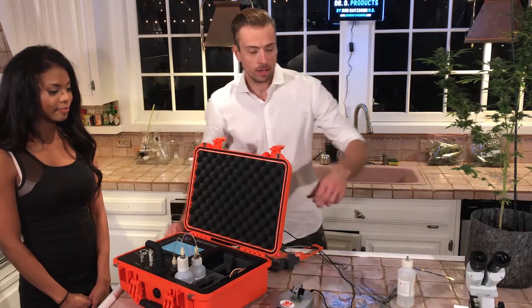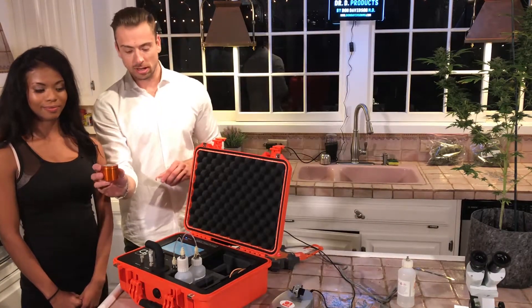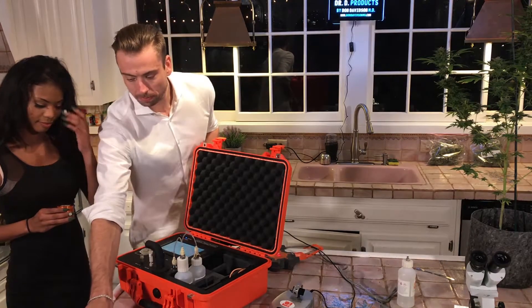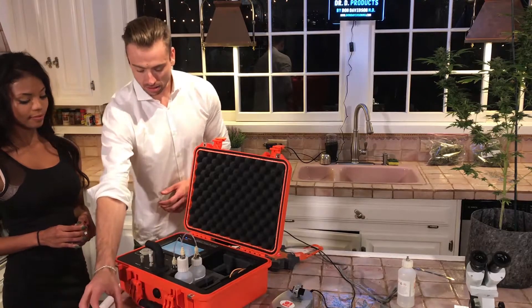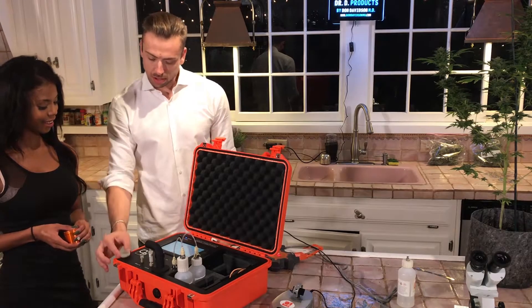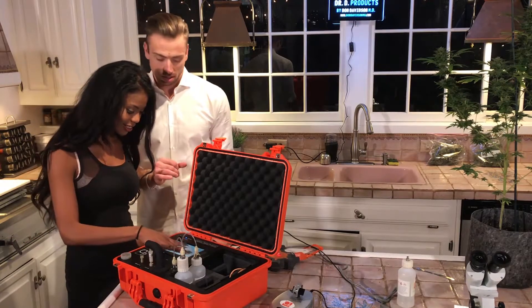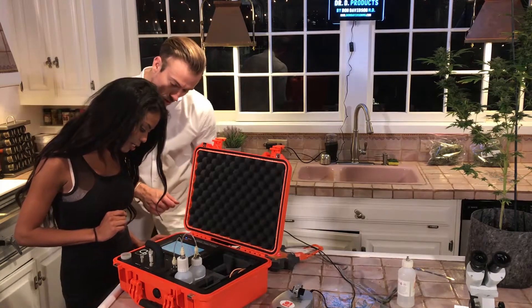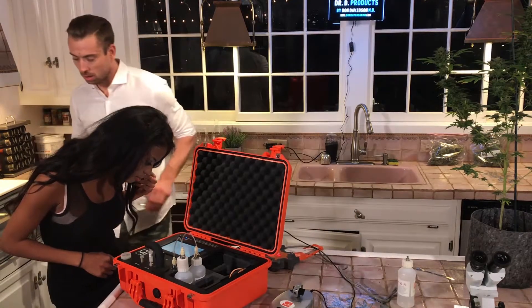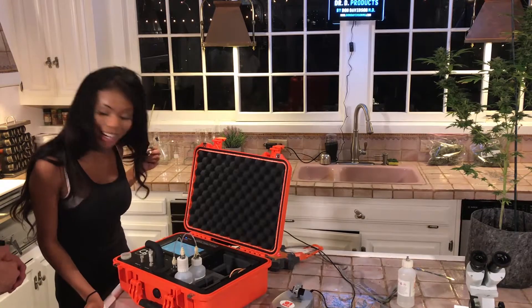What Nia has already done is use this grinder here — she took some of this wonderful flower and ground it up, so we have some already in this vial. Let's move on to the next step. Now you're going to take this scale. Step two: place a vial on the scale. So grab one of the vials.